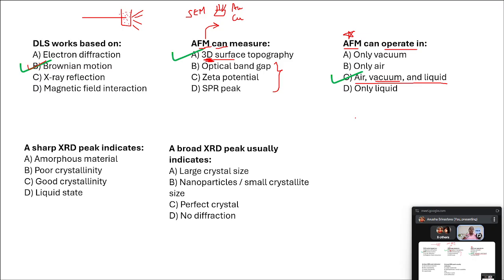What is the principle, what is the instrumentation, like the very fine differences we saw between the instrumentation setup for the absorption spectrophotometer and the fluorimeter: the reference cuvettes, and the optical path of light. In the case of absorption, it was straight, 180 degrees. In the case of the fluorimeter, there was a 90-degree deflection that we saw. These are very small, subtle things, but all of us should know these basic things.